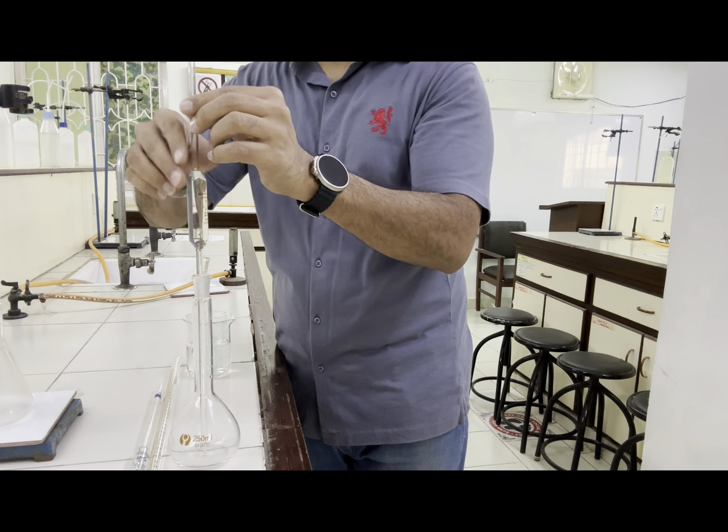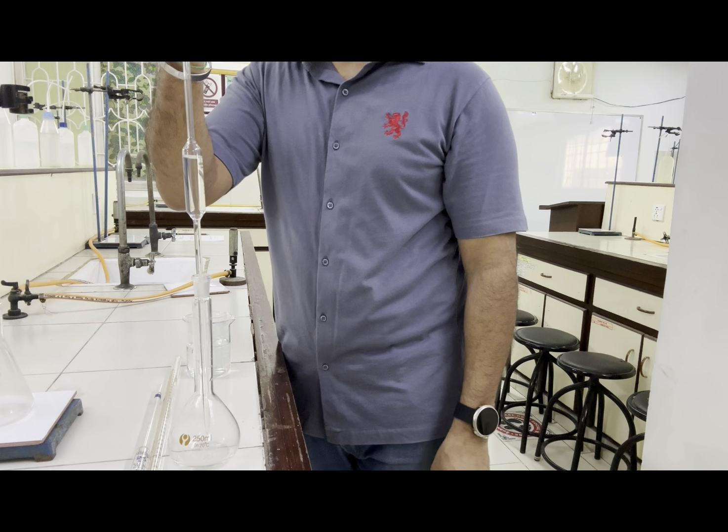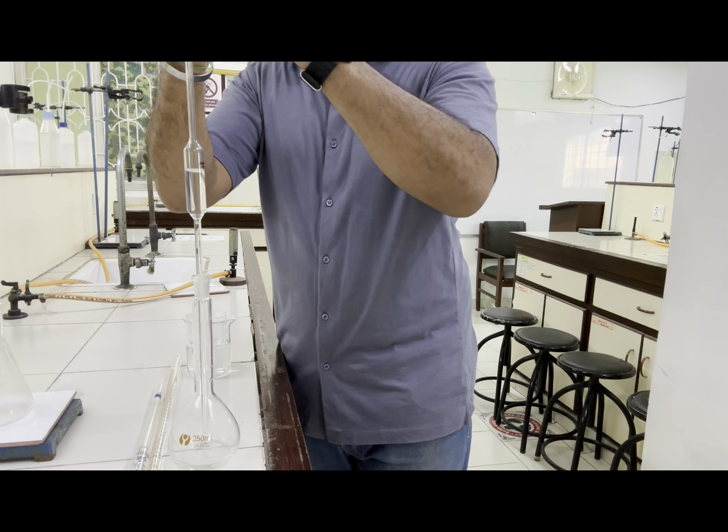By pressing this E button, or you can remove the pipette filler, again the same thing, the liquid will drain out.